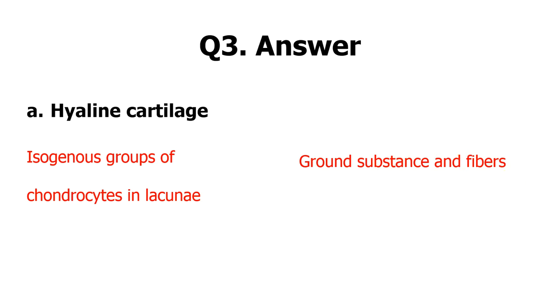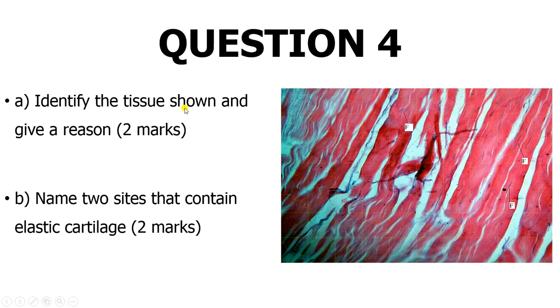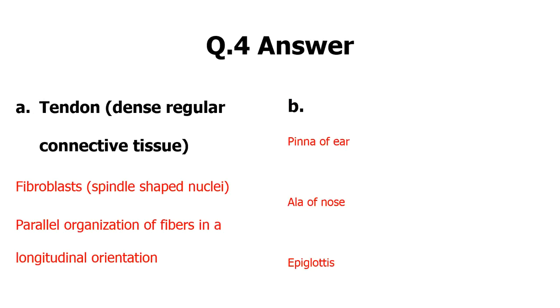Here you are told to identify the tissue and give a reason, and to name two sites that contain elastic cartilage. You can see the parallel organization of connective tissue fibers — this is collagen type one. These longitudinally arranged parallel collagen fibers represent tendinous fibers, so this is a tendon: dense regular connective tissue. The spindle-shaped nuclei visible here are nuclei of fibroblast cells. Two sites containing elastic cartilage are the pinna of the ear, the ala of the nose, and the epiglottis.